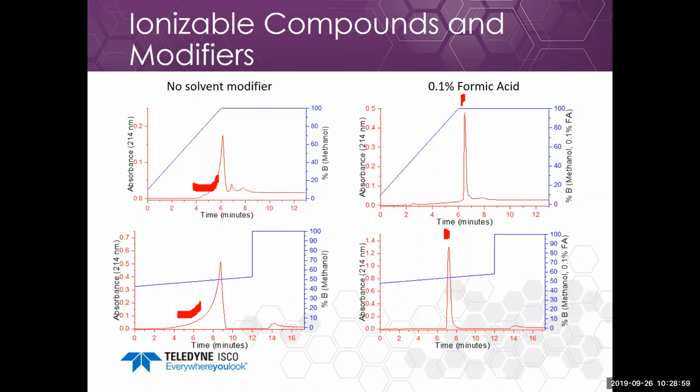And therefore, you might not see it during the focus gradient run off of a zone calculation. Over here, we try to optimize the gradient for every compound. So if it elutes a little bit late, it doesn't really matter very much because you still get your compound purified. It still runs on the gradient.